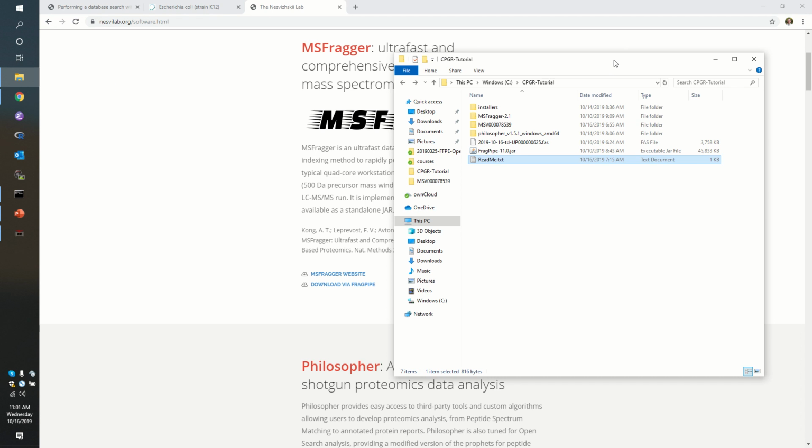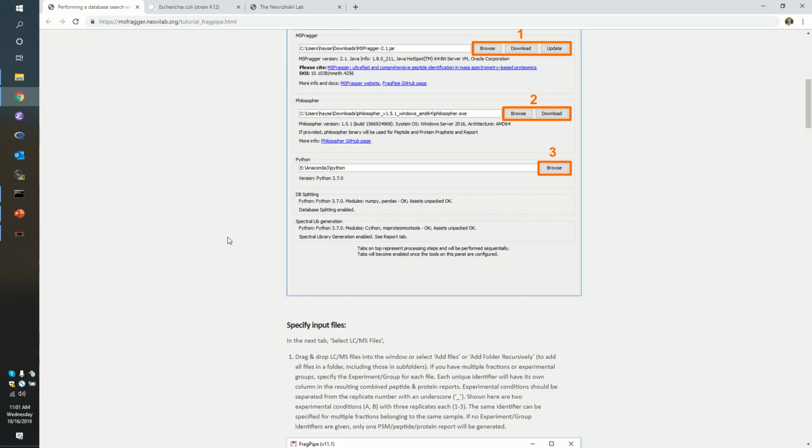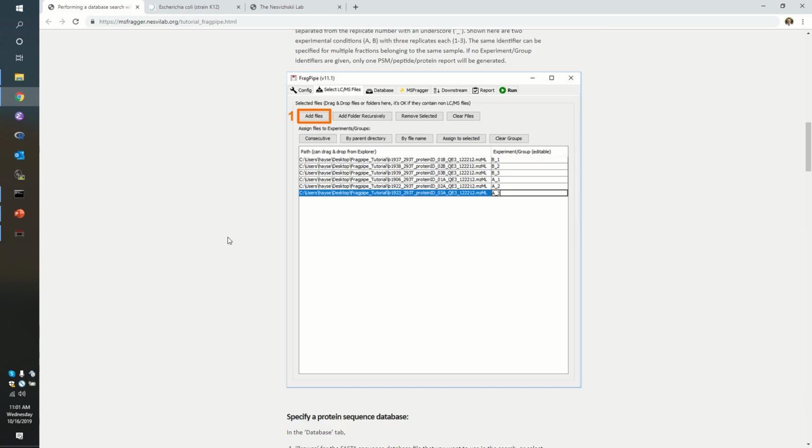So as usual, the README file just gives you some hints about where all this stuff came from. I mentioned that there's a tutorial online created by Sarah and friends. You can follow that here. This is what you would get if you followed that URL. You can see they've got pretty good screenshots and explanations about what each of these steps is useful for. I believe they even have raw data that you can download to run on exactly the same files as they use there.